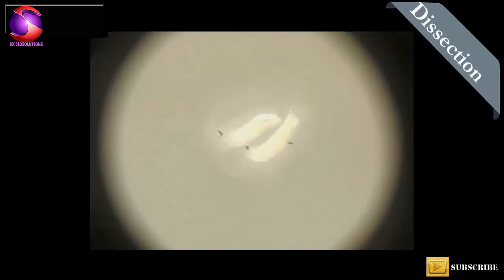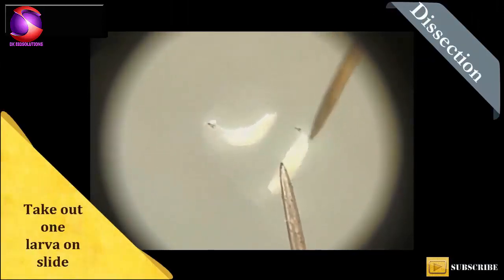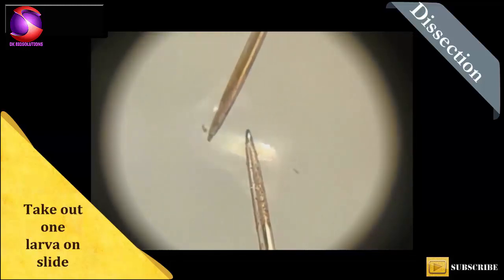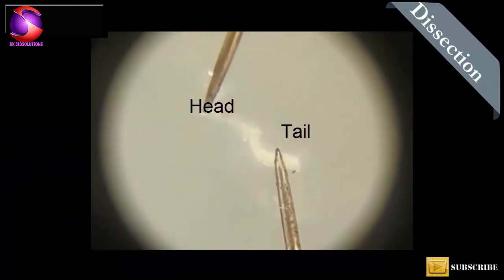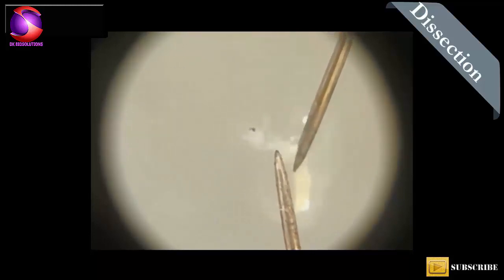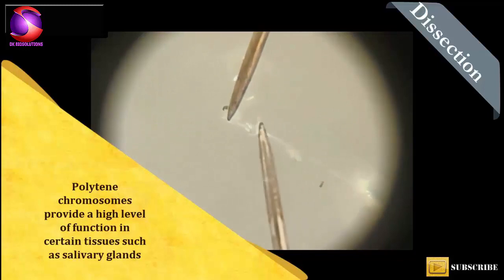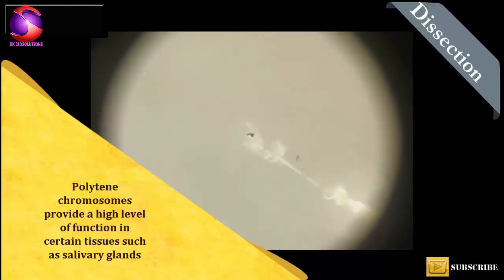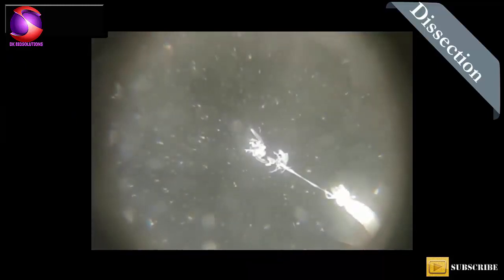Now we will start with dissection of Drosophila larvae to get salivary glands. We need two pointed needles to dissect this small larvae. Hold the broad end with one needle and pull the head part with the second needle. You will get two intact salivary glands. Remove all unwanted parts.